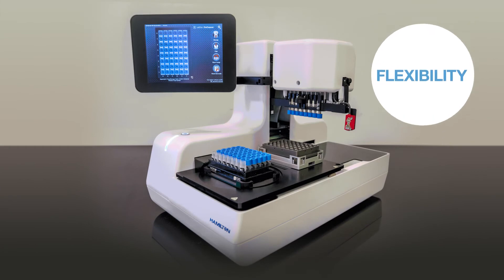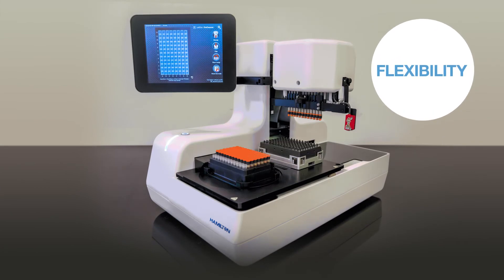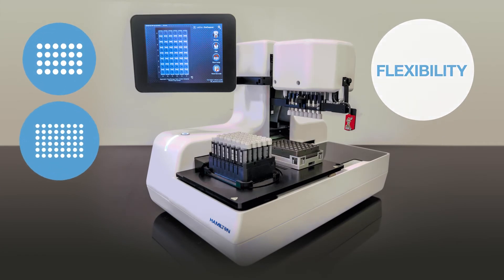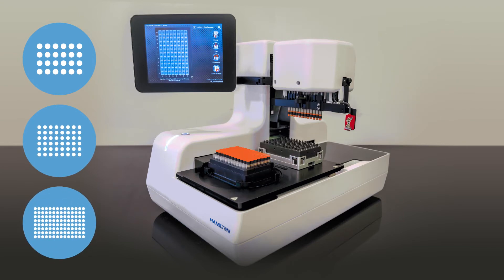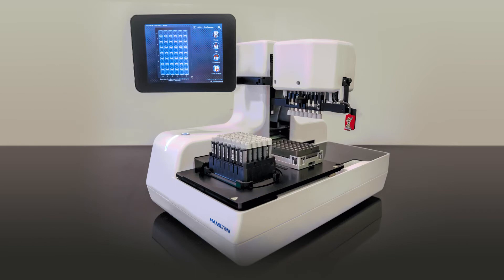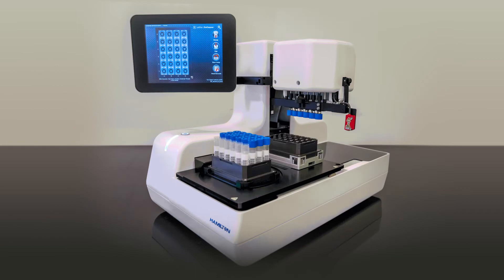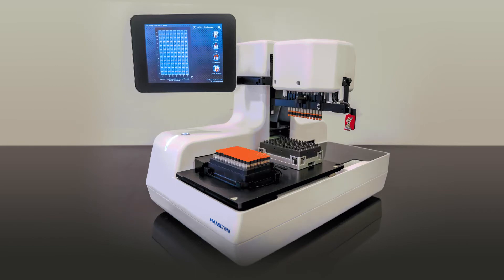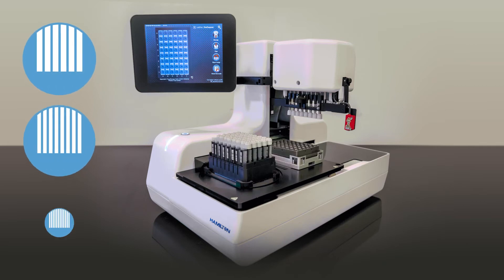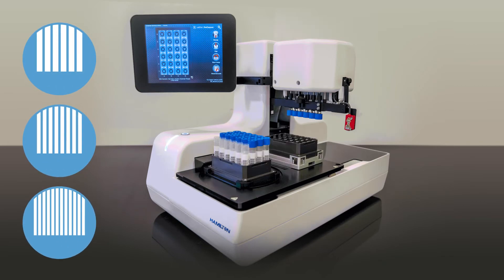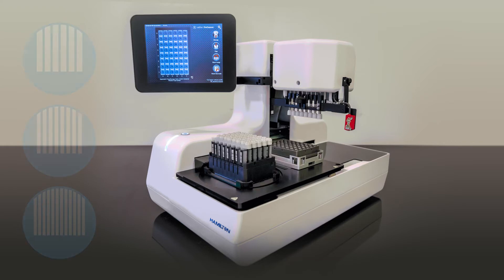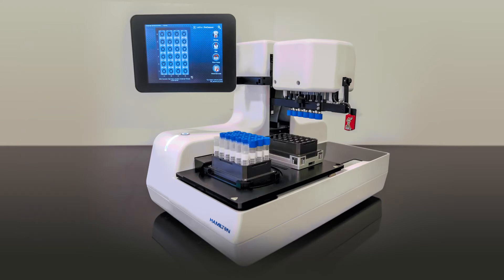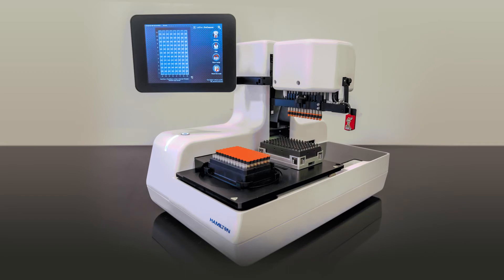The Decapper also offers impressive flexibility. It is designed to work with 24, 48 and 96 format tube racks from a variety of vendors and labware in different volumes ranging from 0.2 milliliters up to 10 milliliters, using the interchangeable 6, 8 and 12 channel heads, allowing you to decap all of your labware on one single device. We'll show you how easy it is to change from one head to another in just a few moments.